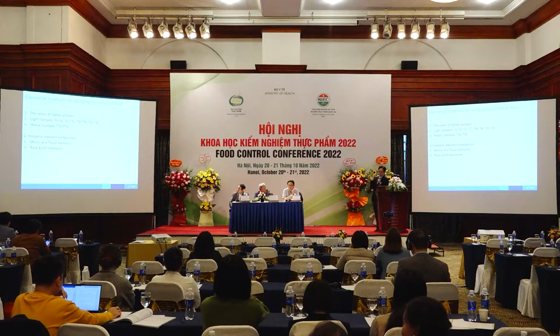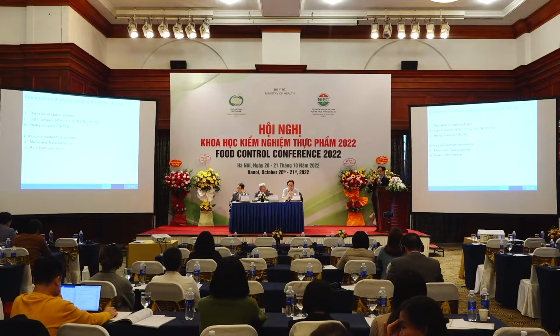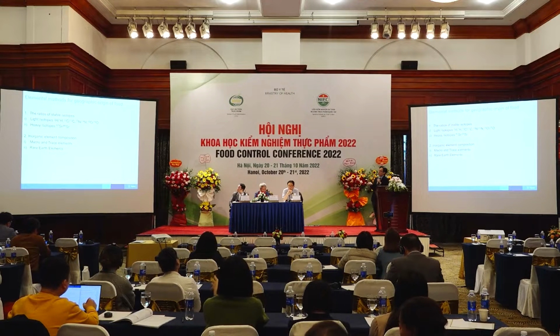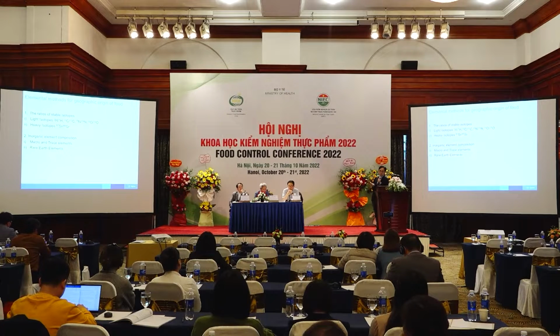But in the examples I'm showing, we are not really interested in looking at isotope ratio, because isotope ratio is a more advanced technique for ICPMS. We are interested in just using inorganic elemental composition, either trace or macro elements, to determine where certain foods can come from.